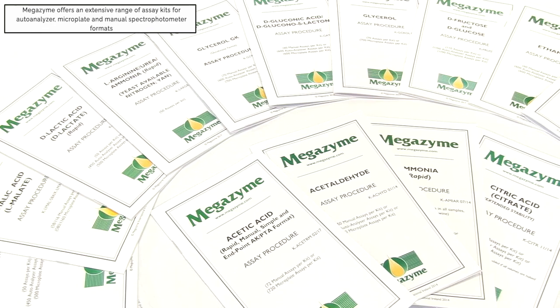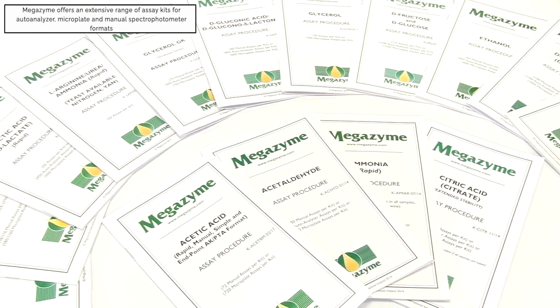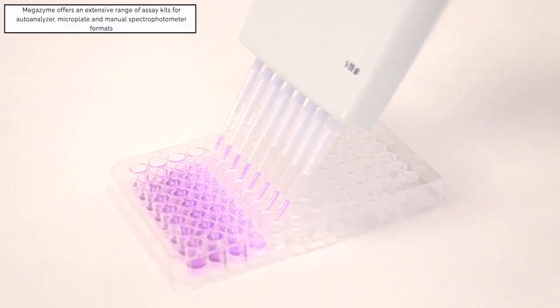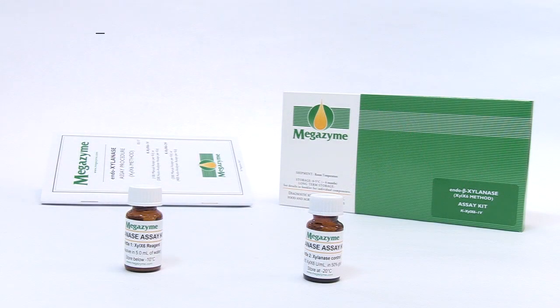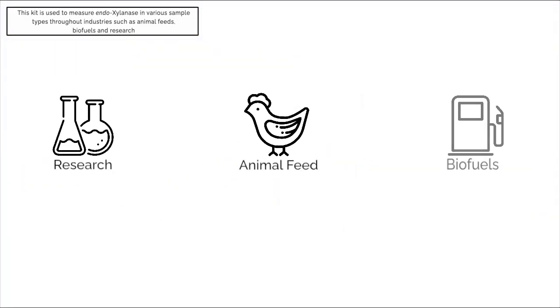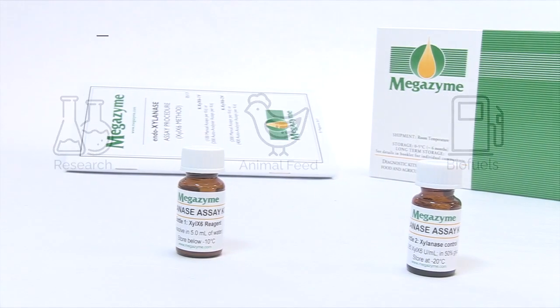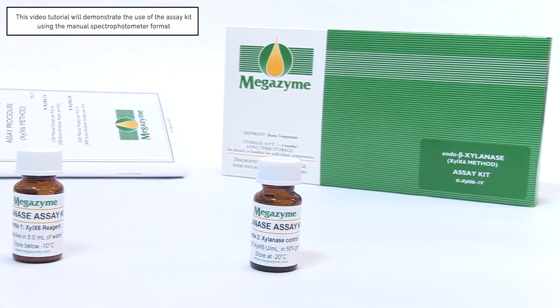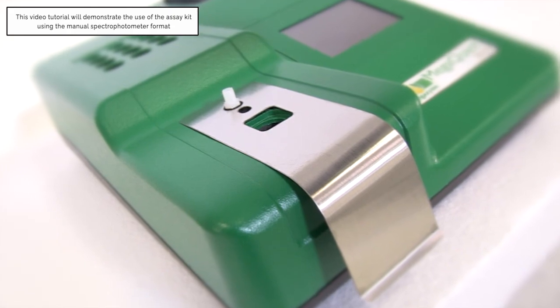Megazyme provides an extensive range of assay kits for use in various assay formats, including autoanalyzer, microplate, and manual spectrophotometer. This endoxylanase assay kit can be used to accurately measure endoxylanase in various sample types throughout industries such as animal feeds, biofuels, and research. This video tutorial will demonstrate the use of the assay kit with an enzyme sample extract and the kit standard using the manual spectrophotometer format.